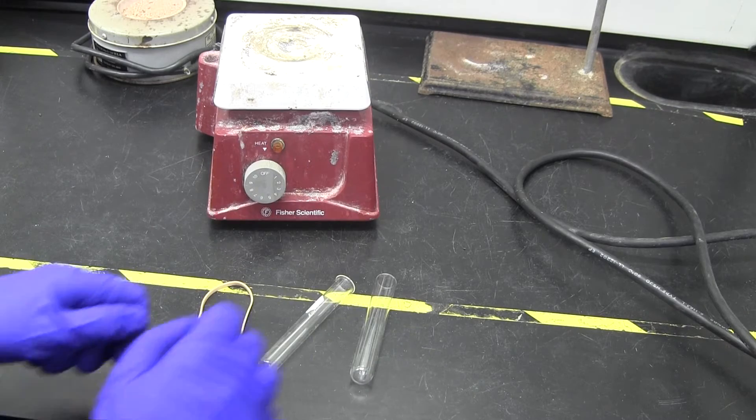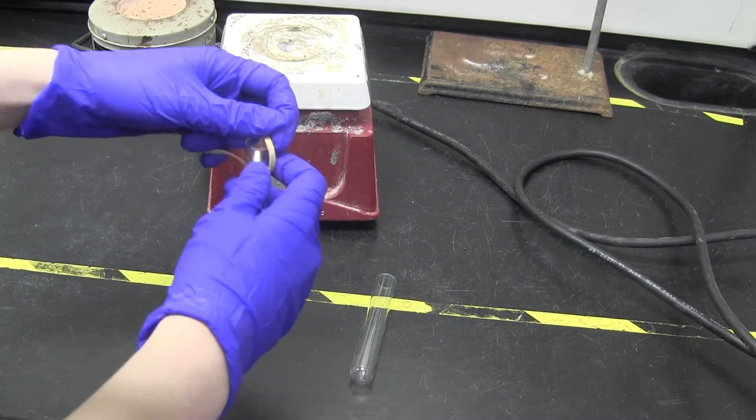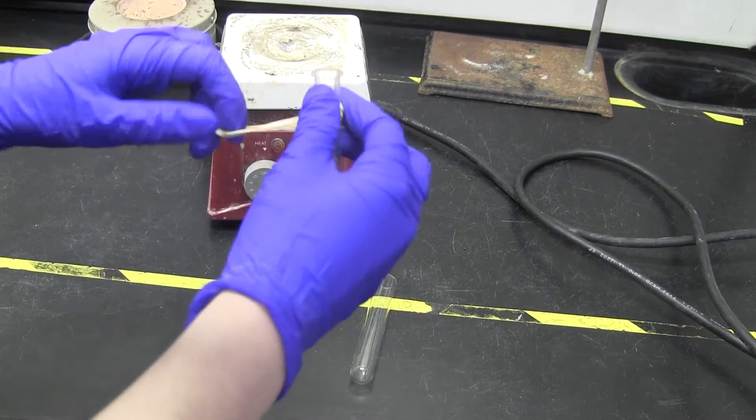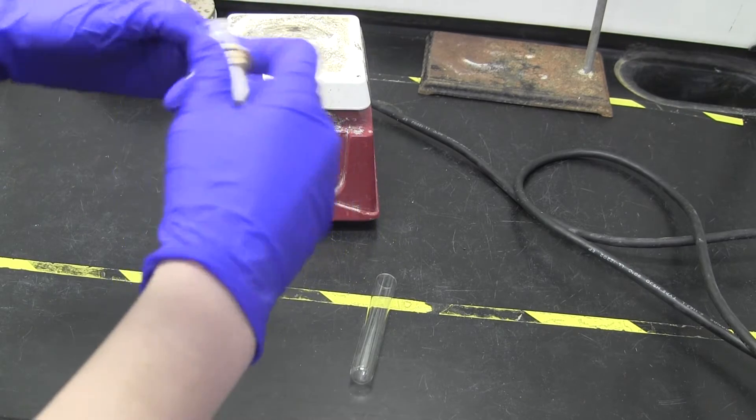You will also need a hot plate and a rubber band. Put the rubber band around the small test tube. This will provide friction to keep the inner test tube from falling into the outer one.